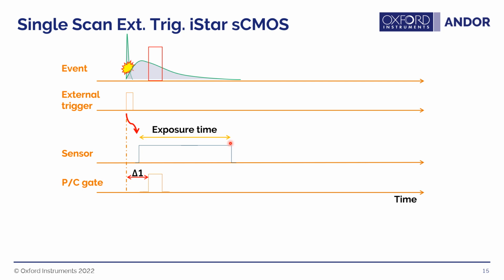However, no light is yet reaching that sensor, because the intensifier gates and controls whether or not light actually reaches the sensor. After a specified time delay that you can put into the software, the gate actually happens, and that is what controls which section of that signal you're acquiring.